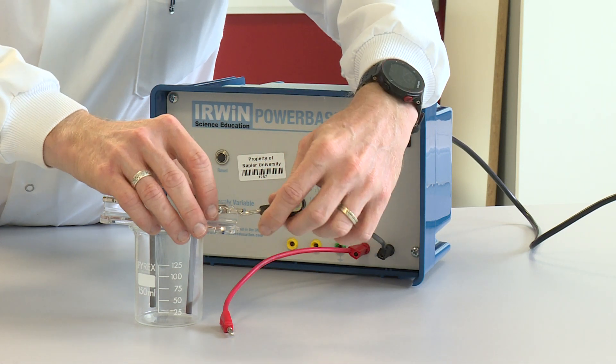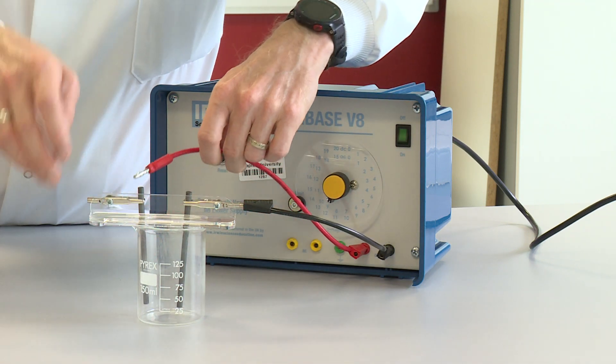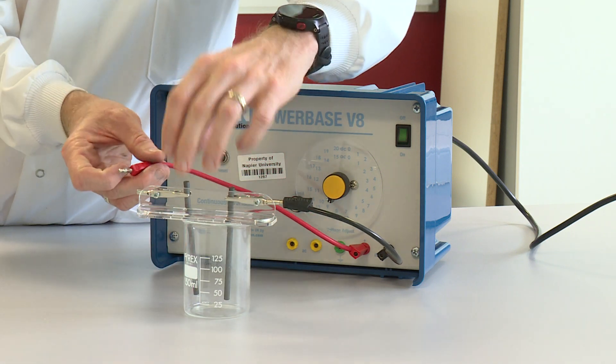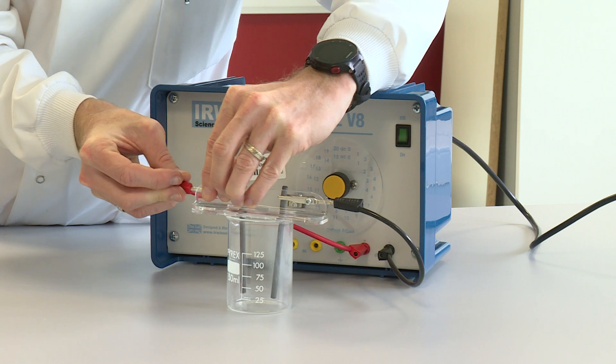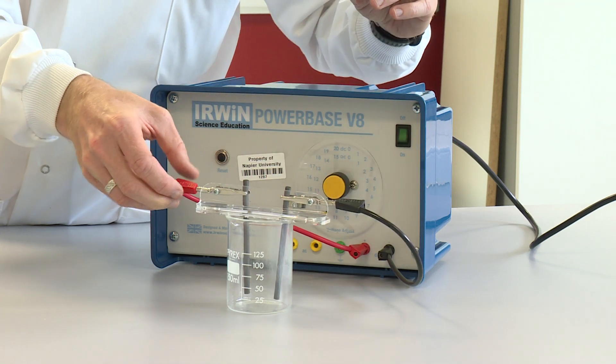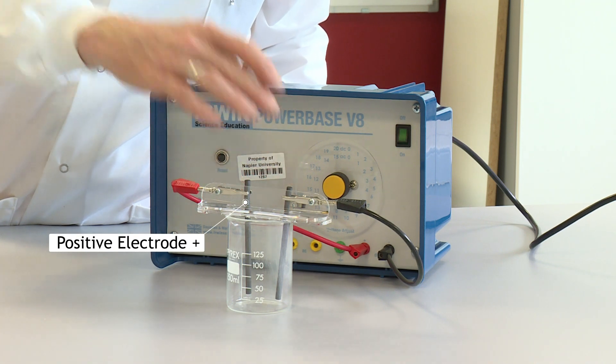I can then attach the wires to the crocodile clips. The black wire is attached to the negative terminal of the power supply and the red wire is attached to the positive terminal of the power supply. So this is my positive electrode and this is my negative electrode.